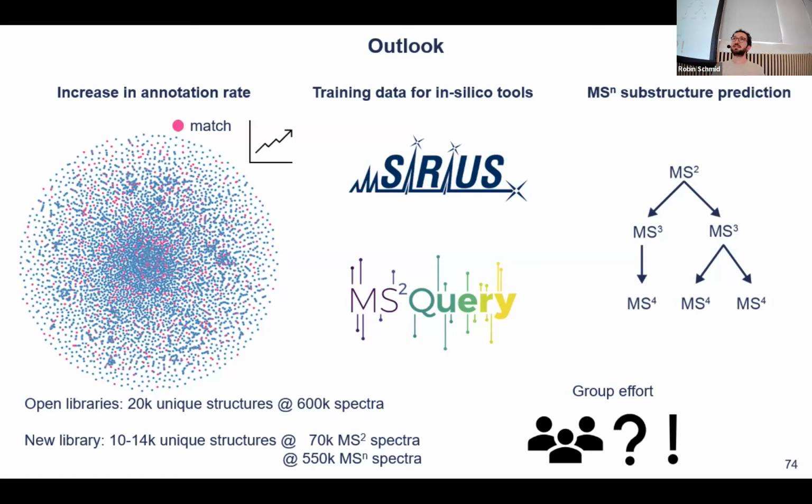So the thing is, there's no standard way of merging spectra. Some people sum them up, some people use the maximum intensity across the scans, because then at least you retain the amplitude. If I just use the maximum intensity across the 3 different energies, at least those are the raw intensities that I got from the instrument. If I sum them up or average them, of course, there's going to be some discrepancy between smaller and larger peaks. We did not really check how much it improves the quality.